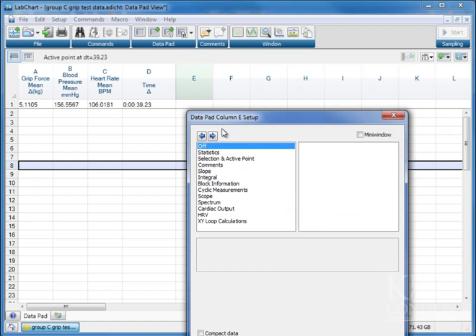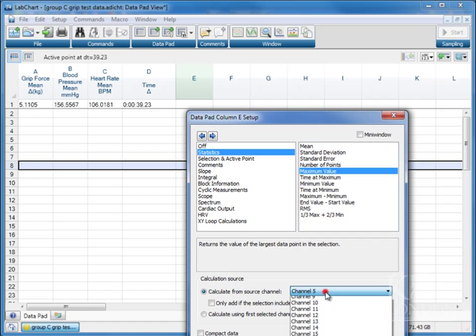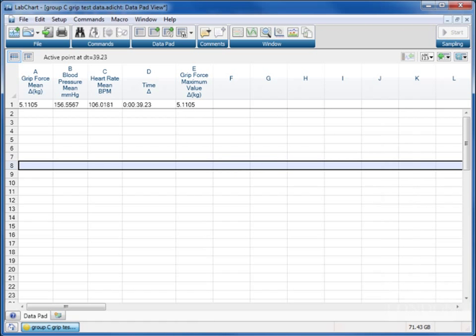So let's check on E, and let's for this one, because we're going to use these data later, let's look at the statistics and let's do a maximum value derived from the grip force, which is the first channel. And there we are. So that's going to give us the maximum deflection.